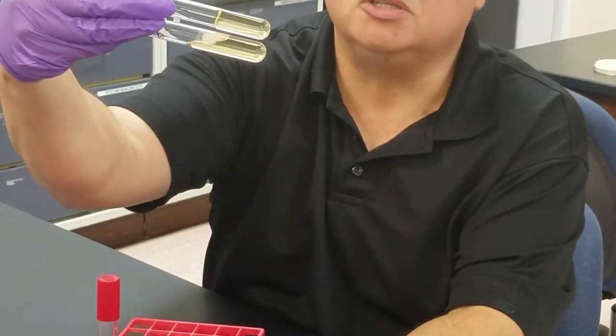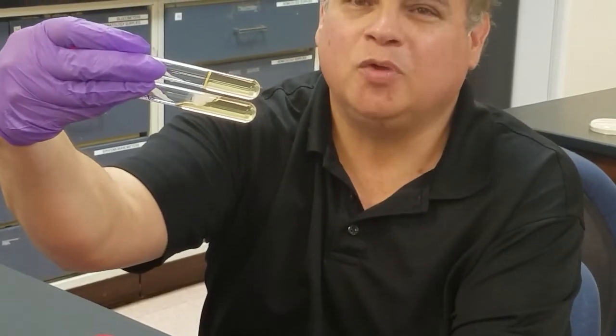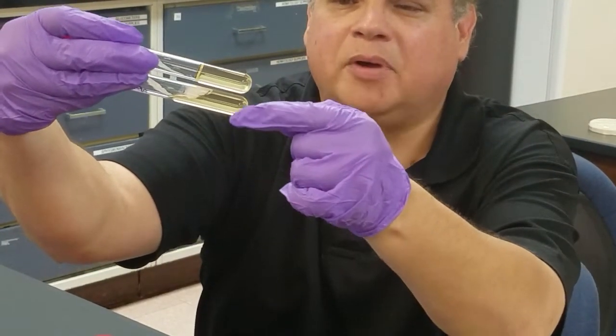You don't want to turn this all the way upright or facing downward because it would come right out of the tube. But you can see that's positive, and if you hold these things right together you can see the difference between positive and negative — negative, positive.